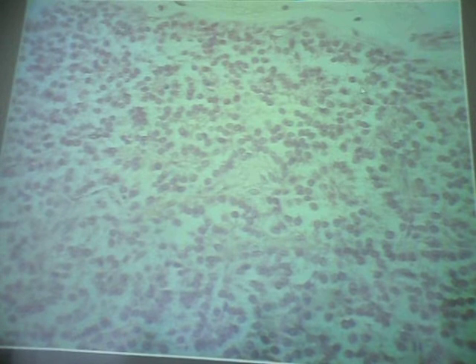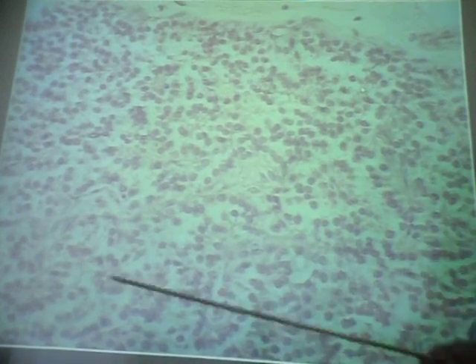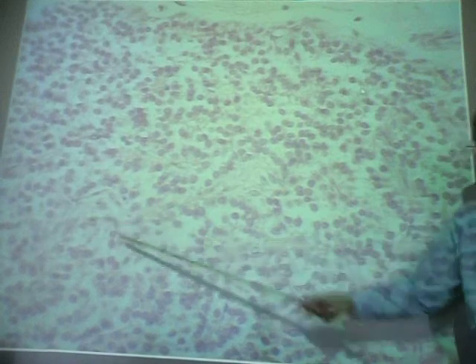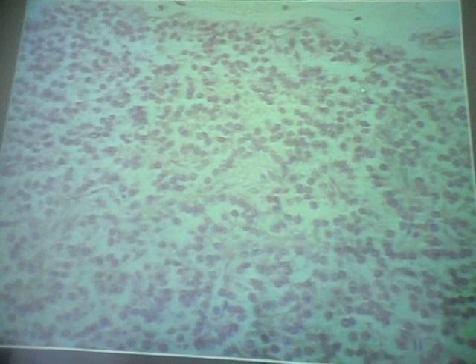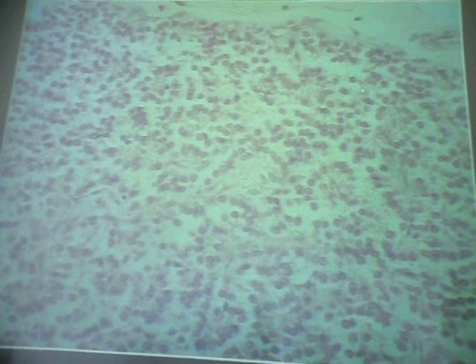Will you point out again the oxyphil cells before you get off that slide? All right, right here. These cells here. They look like they're blurred. Yeah, it looks like there's no nucleus in here. Yeah, they're bigger. So how do they come up with a name for the cell if they don't know what it does? I don't know. I don't know where the name came from. Maybe they love oxyphil.